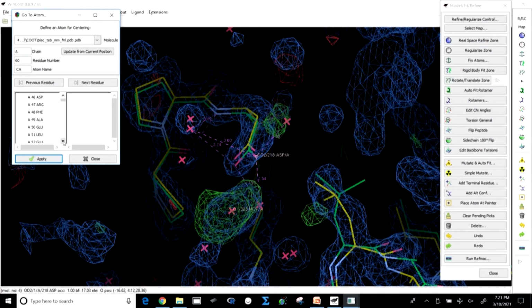Here we are actually talking about structure based drug designing. This is one of the perfect examples of structure based drug designing, and along with that we will also talk about protein engineering. So if you go there in the PDB file, you see waters are there, amino acids are there, and in between you will see that there are phosphates and something which is not common.